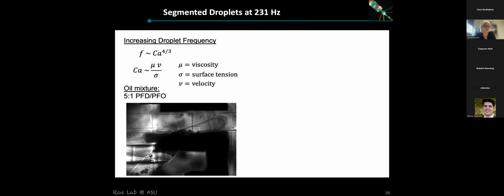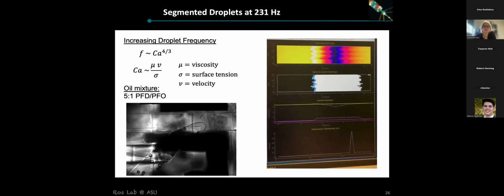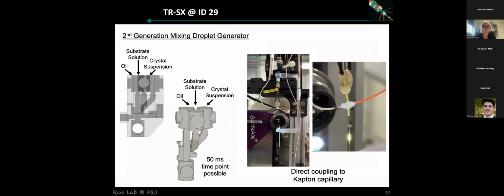And this is an at-home experiment with polystyrene beads included here. And we achieve lock-in. Notably, the really nice peak here at 230 hertz shows that this is possible. Okay, and it's a little bit hard to move on.